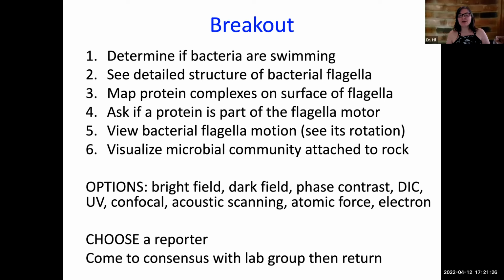It's interesting because this would actually work for a eukaryotic flagellum, and I didn't specify. So for a eukaryotic flagellum, certainly possible. Bacterial flagella are so teeny that you would probably have to resort to an electron microscope again, or an atomic force microscope could do the trick too.